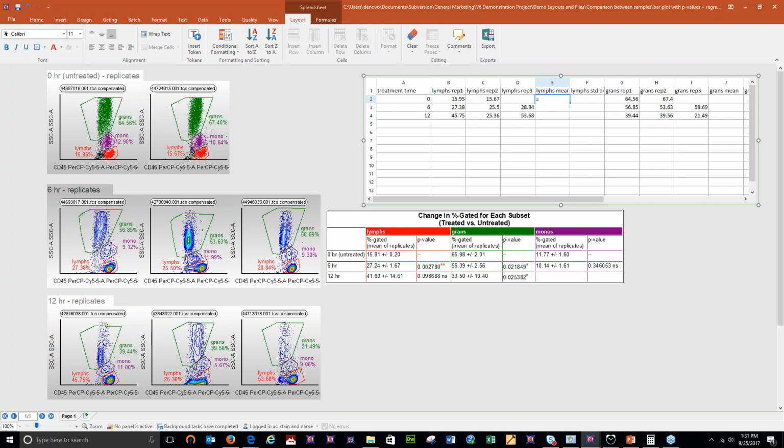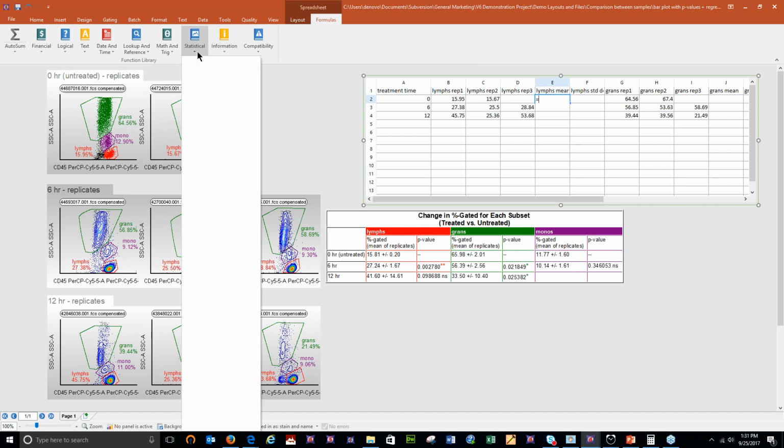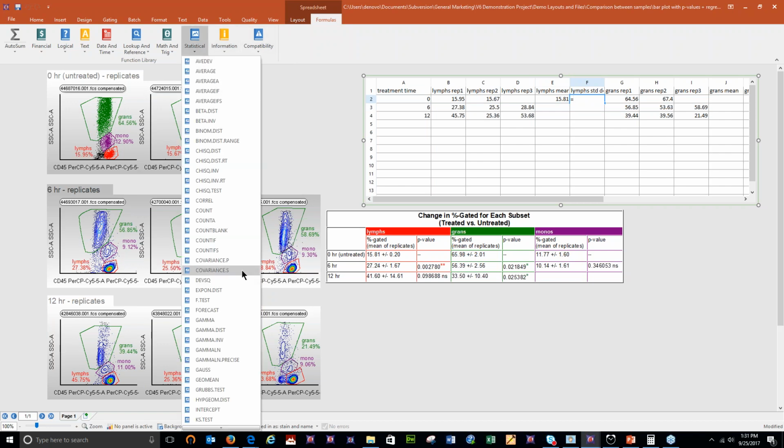We're going to type an equal sign. And this looks a lot like it would in Excel. So you could either just write out the word average, like you might be doing in Excel, or come to our formulas tab and put in the average formula, and then just drag your cursor to select the cells and hit return. Okay, I can do a column fill here. Well, let me actually wait and let me put in the standard dev now to the error bars column.